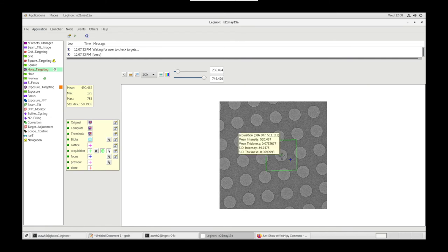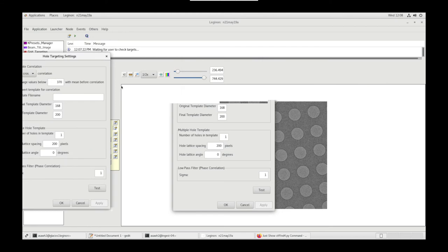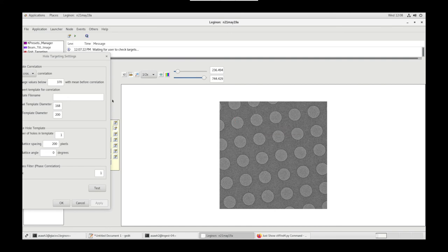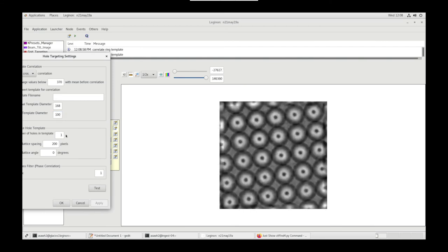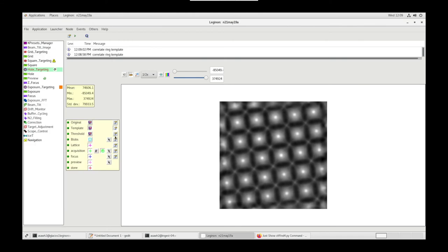Go to Hole Targeting. Let's remove the target that's already there. Let's go to Template Settings. Using the Ruler tool, let's measure the diameter of a hole. Let's input that value into the template diameter. Click Test. That's not great, so let's go up in increment. Alright, that looks good. We have bright white peaks in the center. OK.